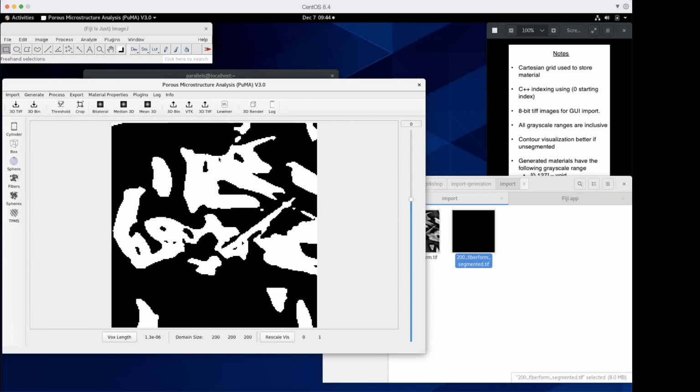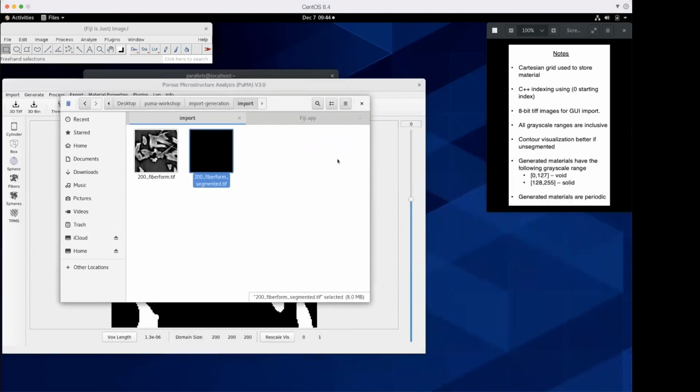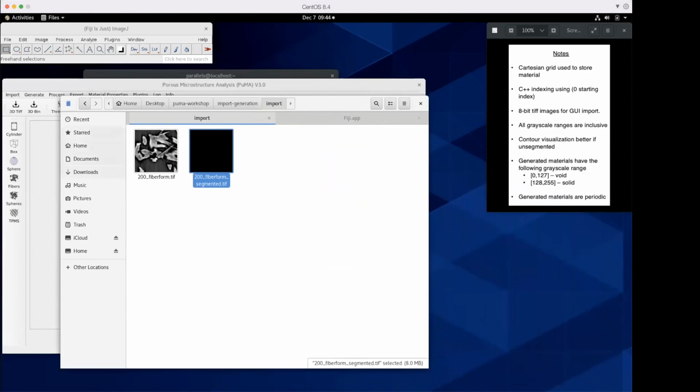Yes. Is it just because of the voxel size not being small enough? As you zoom out to maybe 1,000 by 1,000 by 1,000, would you prefer to have this sharpness of the threshold? No, it's not that. Let me see if I can annotate on my screen to try to explain why this is happening.